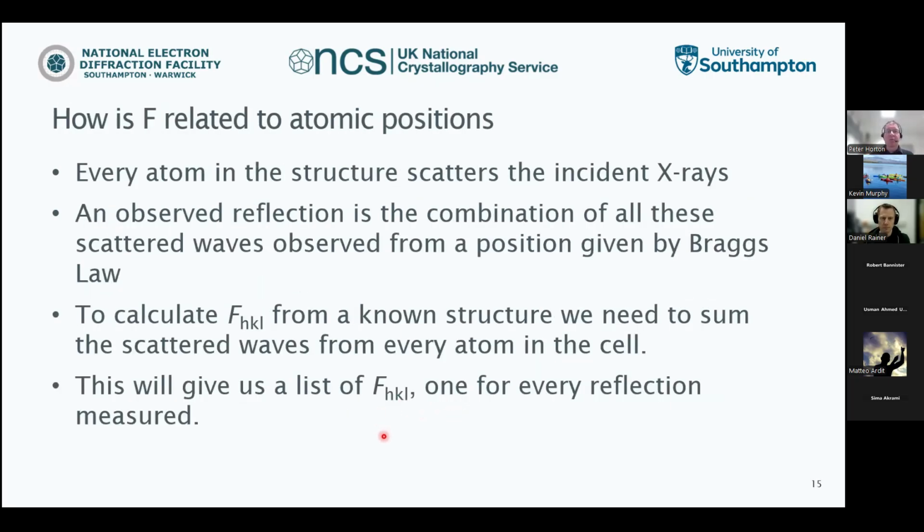Now, that structure factor is related to all the atoms in the structure. Every single one of them will scatter and produce something to do with those waves. It's tiny amounts, but because we've got billions of atoms, they all add together. And we can reduce it down to something that's actually sensible to work with. Because if you were trying to calculate with a billion atoms all related to this structure, we'd have no chance of getting anything to work at all. But luckily, we can condense it down.